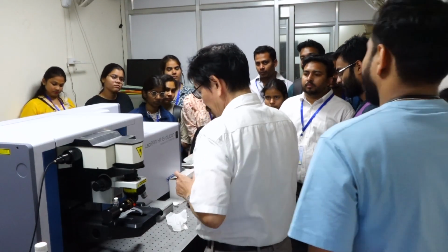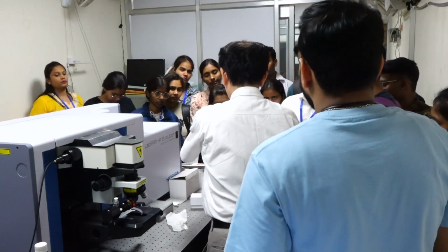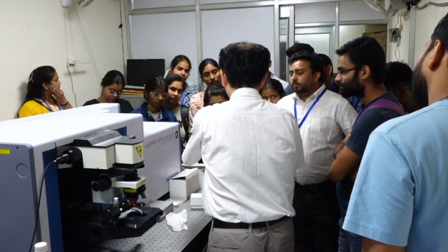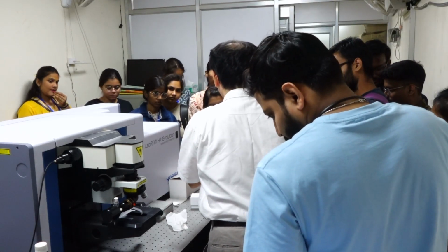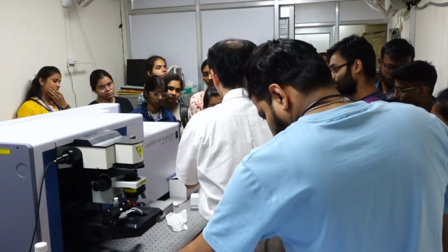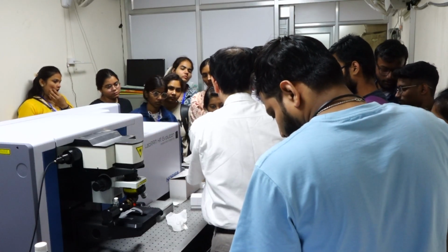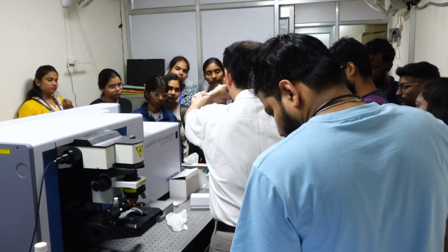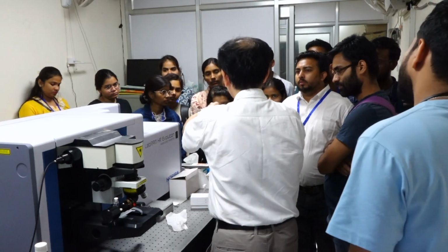So in this setup, all the signals come from the focal point, no other point. So all the detected signal comes from the sample. If the focal point is far from the good point, then it comes from air, so nothing.